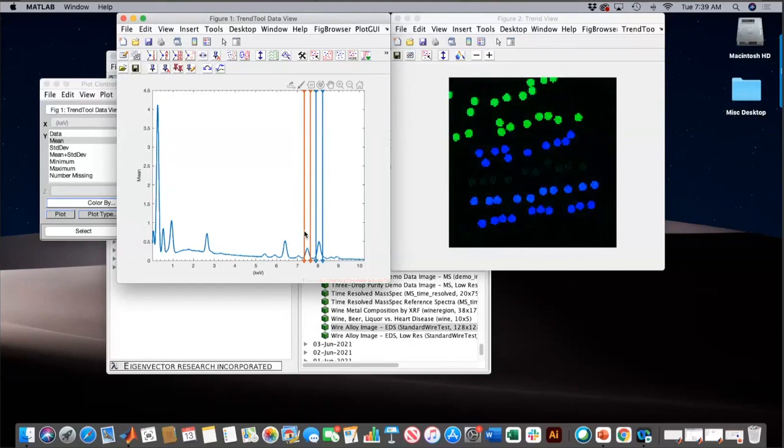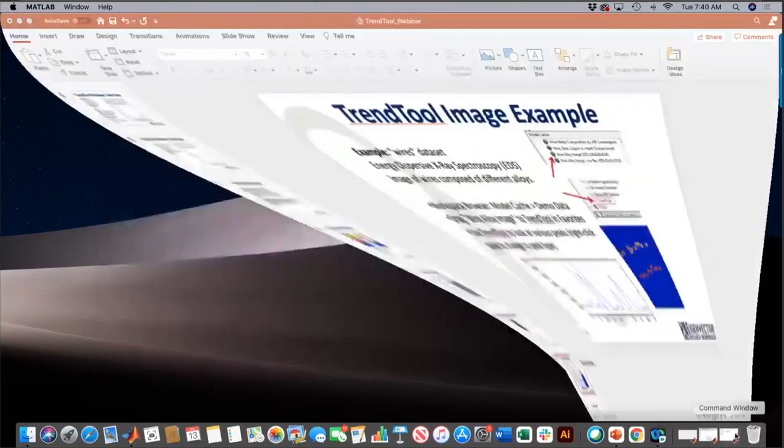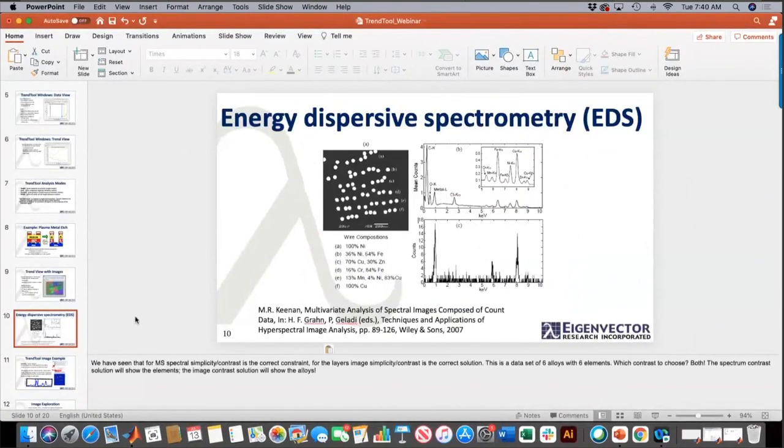And so now here, this is where the challenge is, and this is something we want to change in the future, is make the bars here match the RGBs here. So this peak though are these green ones, and the first one we set are the blue ones. And let me see, what other peak am I looking for here? I want to go back to my presentation and remember what's what. So I've found the, oh, so that's the nickel peak right there.